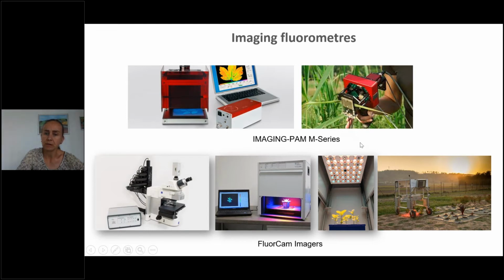In respect of the tools that are available, there are different versions of the imaging PAMs from Walz, and I would say quite a big plethora of FluorCam imagers that are manufactured and developed by PSI.